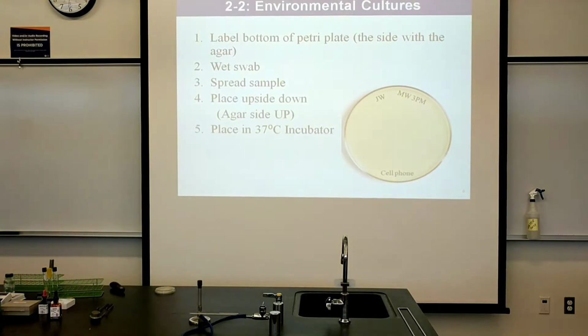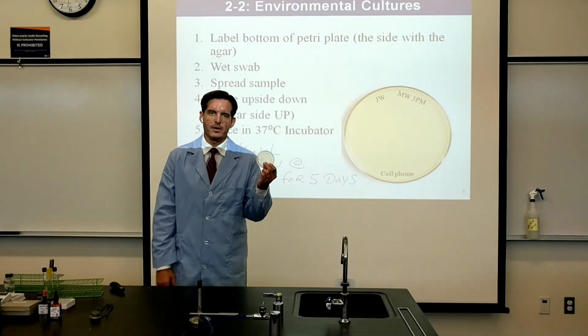And so we'll write that down. Additional incubation at room temperature. That's what we're going to do next for 5 days. So in total, we'll have 7 days worth of possible growth on our plates.